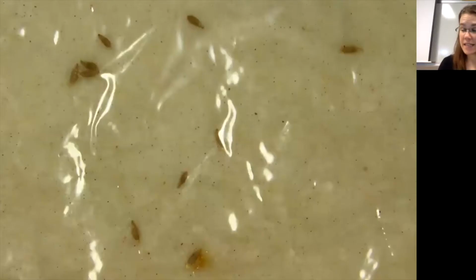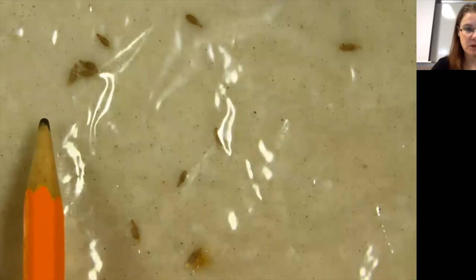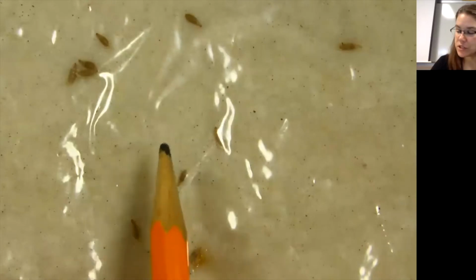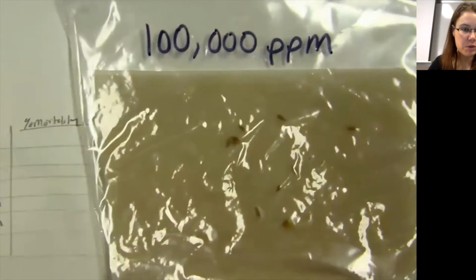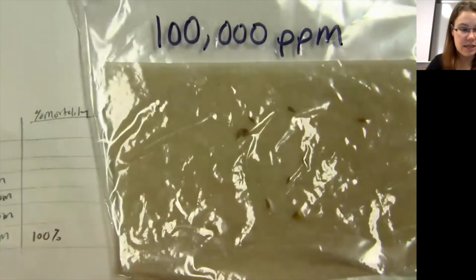So it's been 4 days. We're looking at the 100,000 parts per million seeds. And you see that none of them have germinated. There's nothing growing out of any of them. So we can assume that all of them died. So for the 100,000 parts per million, the percent mortality would be 100%.